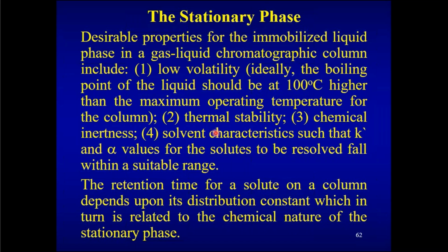Secondly, the stationary phase must have thermal stability. Because we are using high temperatures, it should not undergo any degradation or deterioration at very high temperatures. Thirdly, chemical inertness is also a desirable property, because the liquid stationary phase must not chemically react with the samples that are going to come into contact with it. And fourth, it should have solvent characteristics such that the K dash and alpha values for the solute to be resolved fall within a suitable range.